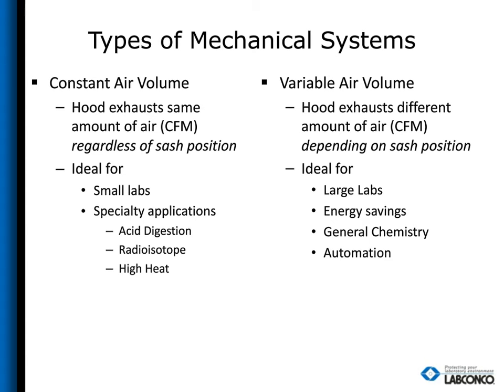These types of setup are best for smaller labs. Maybe the lab isn't being used all the time, so for labs with minimal use, or specialty application hoods where you don't want the face velocity to change.